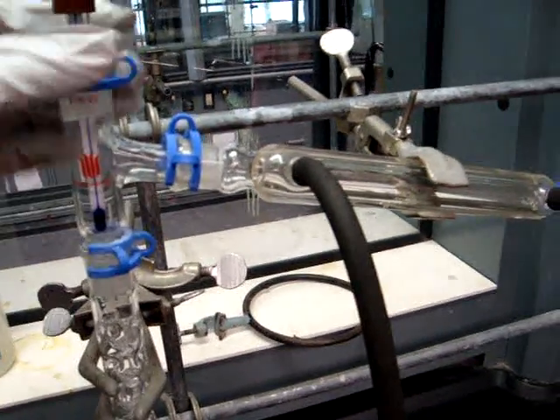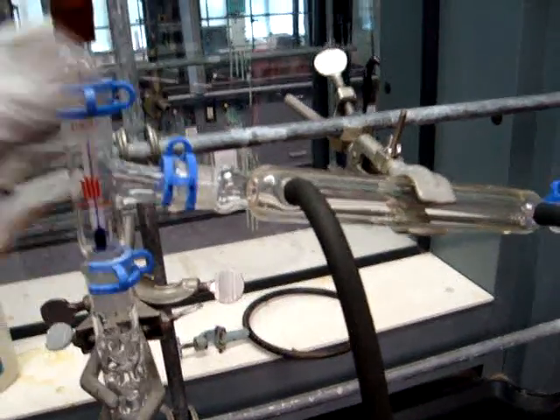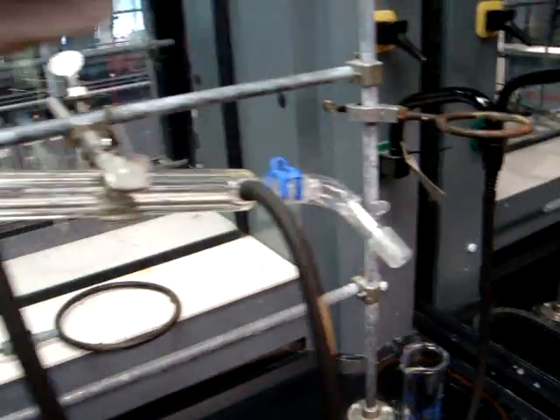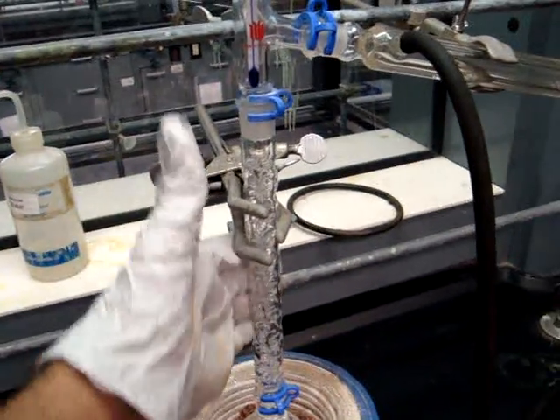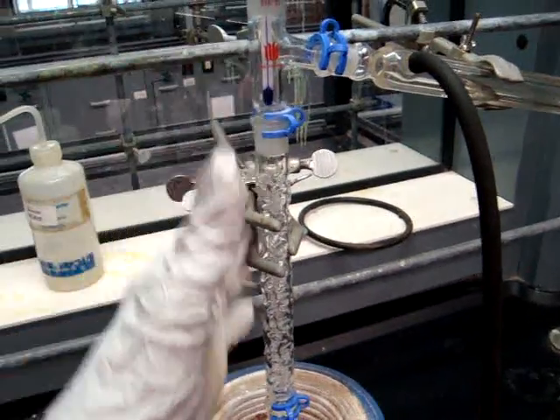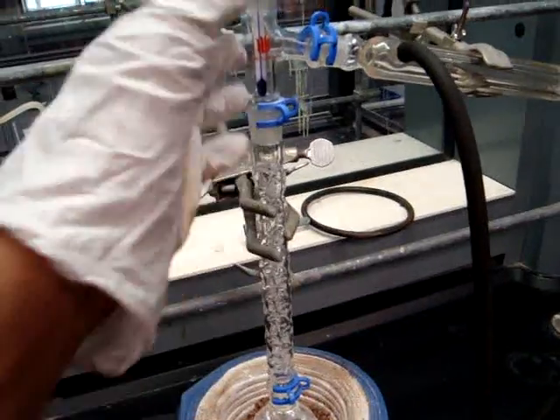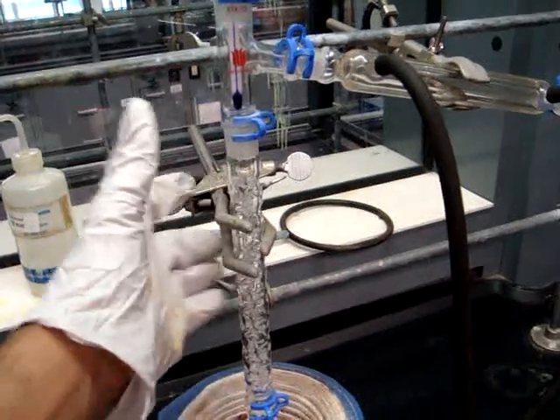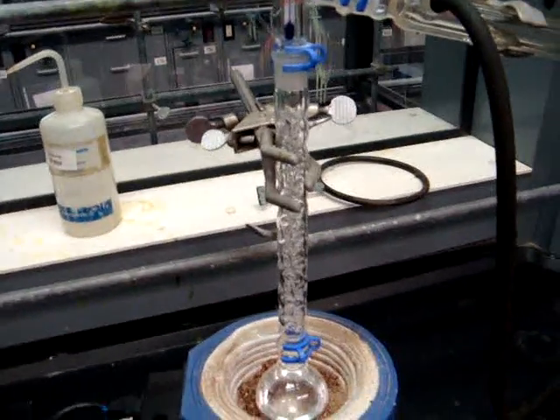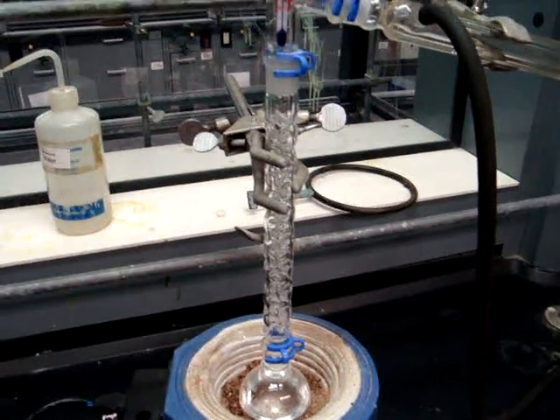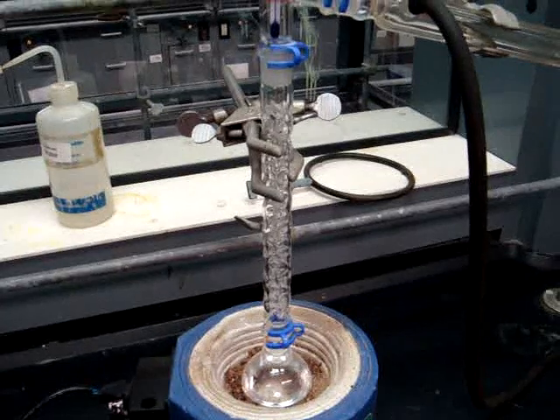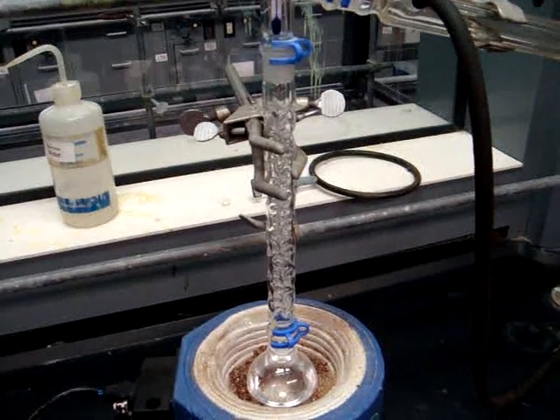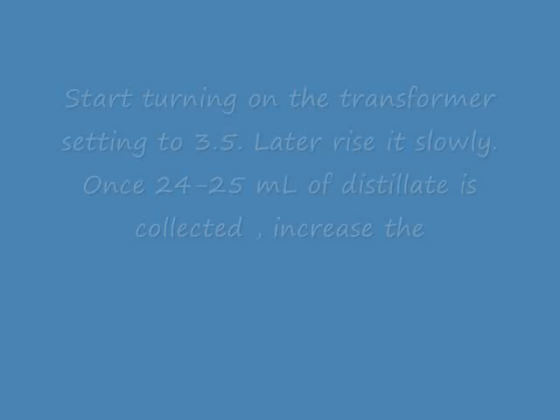Your entire apparatus needs to be clamped in all places and secured tightly to the bench. As you can see, this is the fractionating column setup — you'll be wrapping the fractionating column in cotton and then wrapping aluminum foil around that to insulate the system so that you do not lose any heat.